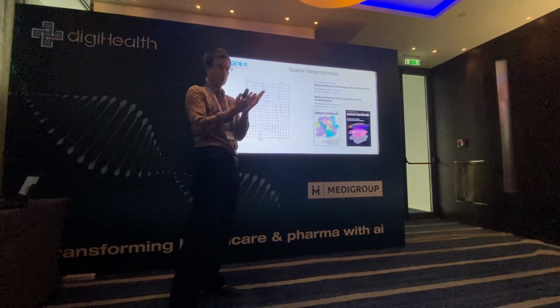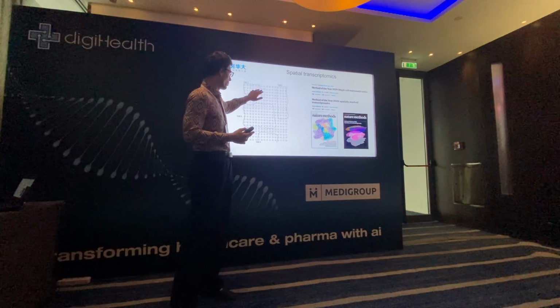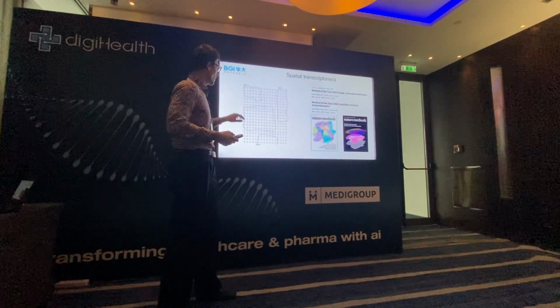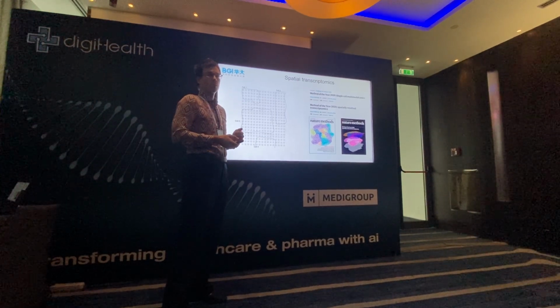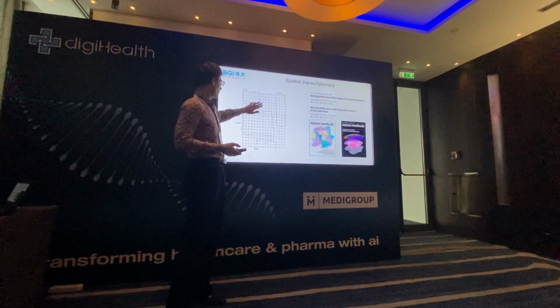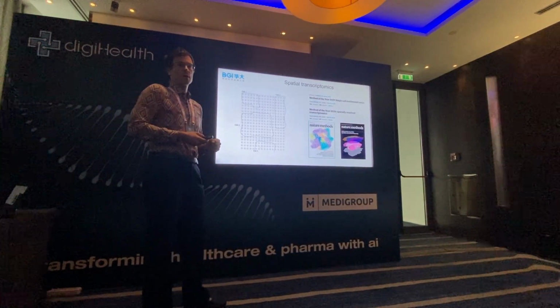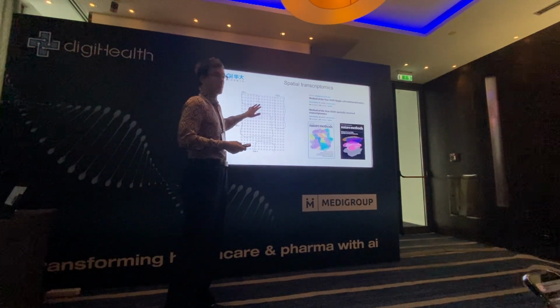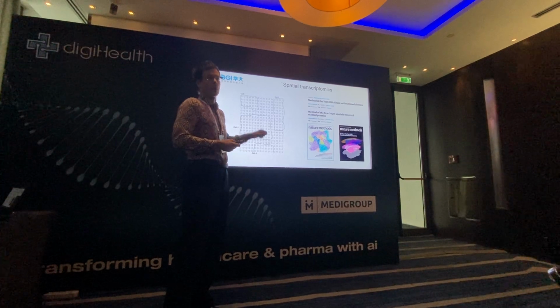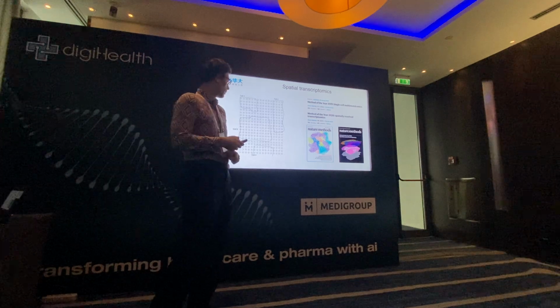So you can cut the solid tissue, put it on the chip with those thin well spots, and when you remove everything beside the genomic material, this genomic material falls into these spots, and you can sequence it there, and you can also keep the information about the position of the individual cells in the tissue.